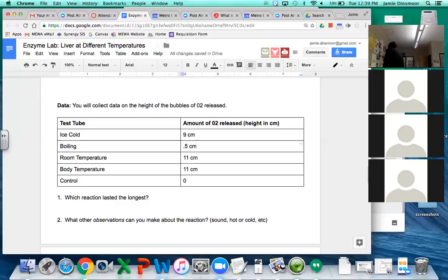wait, but I thought the hotter that we made it, the better it would be, right? But there's a certain point where it gets so hot that you actually cook the enzymes. They're completely denatured at this point, in the most extreme form. They can't function at all, right? There's like 3 of them still going. That's it. In the room temperature and the body temperature, right?